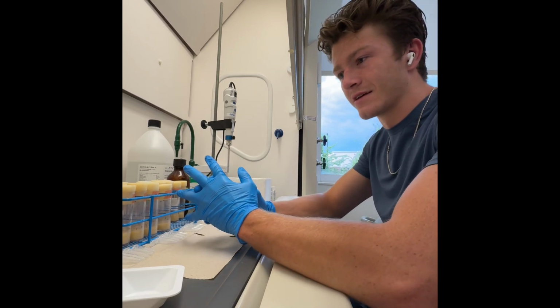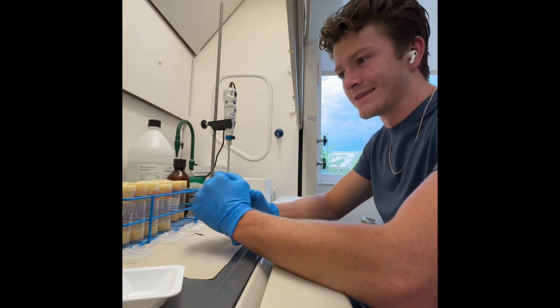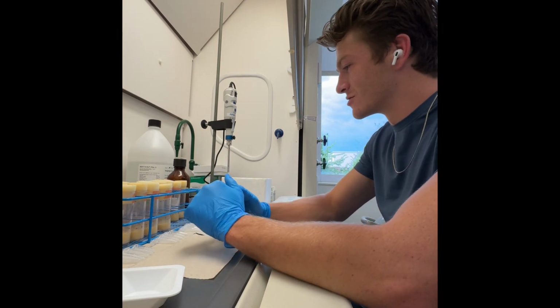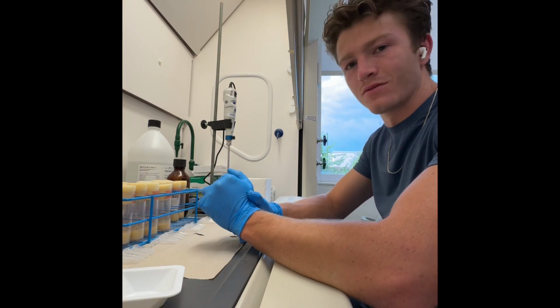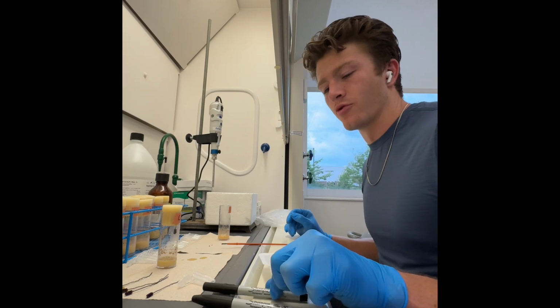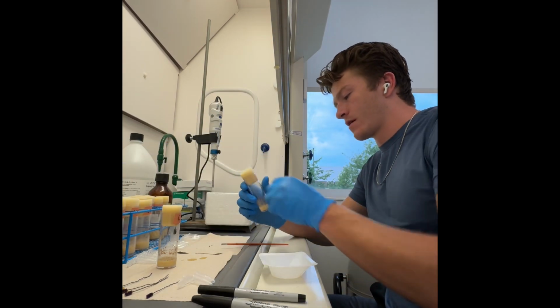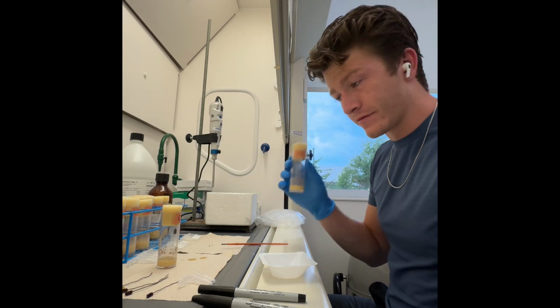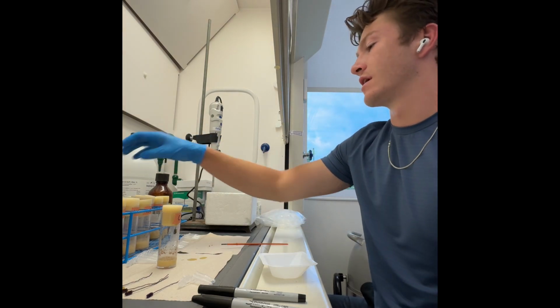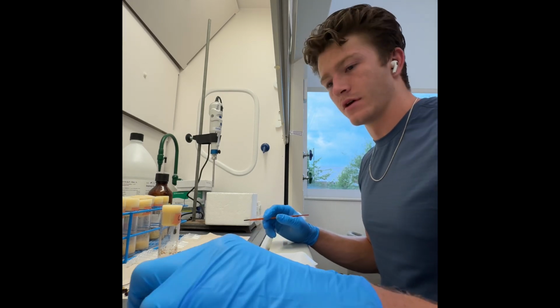Now that I have been working with sorbitol, I see it all over the place in gum and candies and things like that. So this is going to be super interesting, and I guess I'll let you watch me work for a little bit. Now this is for my people who want to see what I am doing: anesthetizing these flies, and there's been 2 weeks of feeding them sorbitol at different levels, different amounts, doses, whatever.